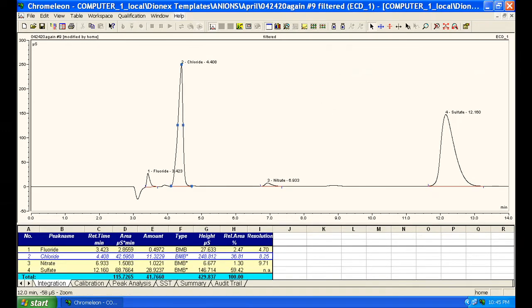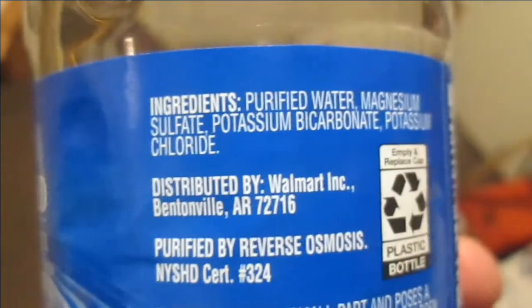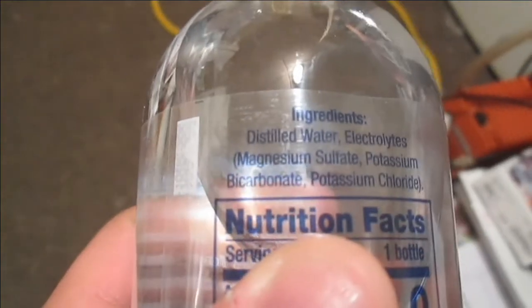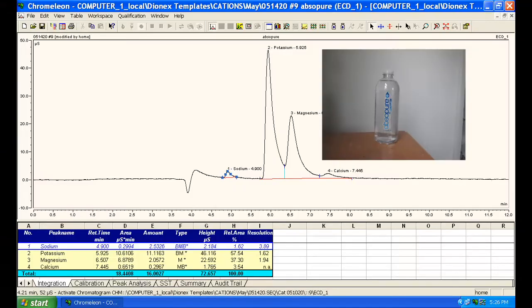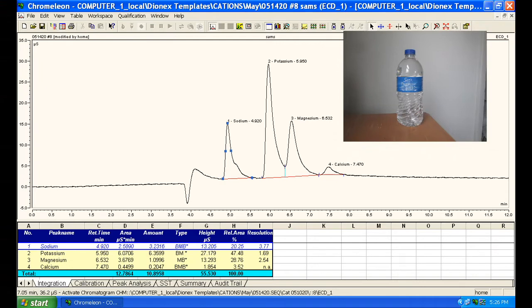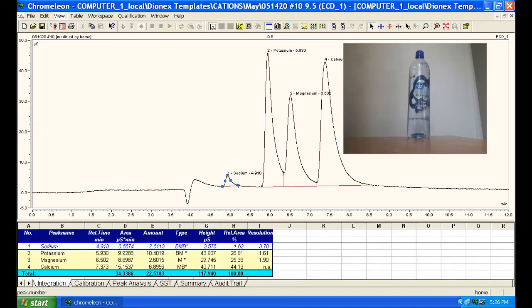I knew what to expect from bottled water since the minerals are indicated on the label, but I did verify there was nothing exotic or out of specification. And since the concentration is not mentioned, this was not really a waste of time. They are very consistent with the anion analysis. The purified water is also very pure, and the alkaline water has the most sodium, calcium, and magnesium.